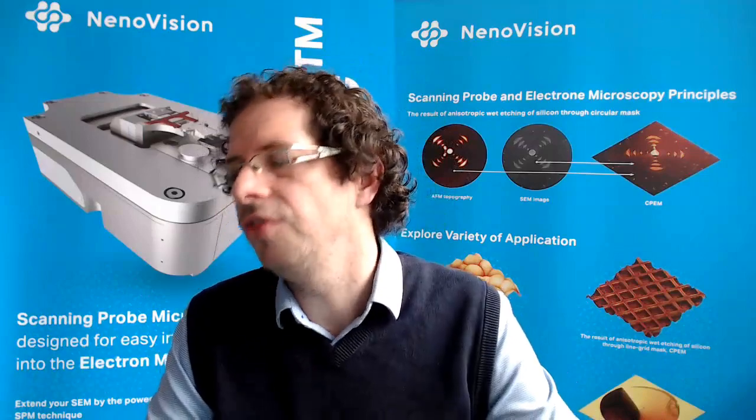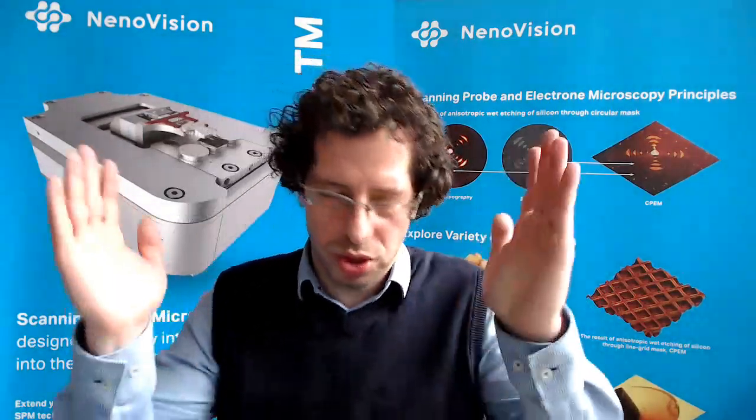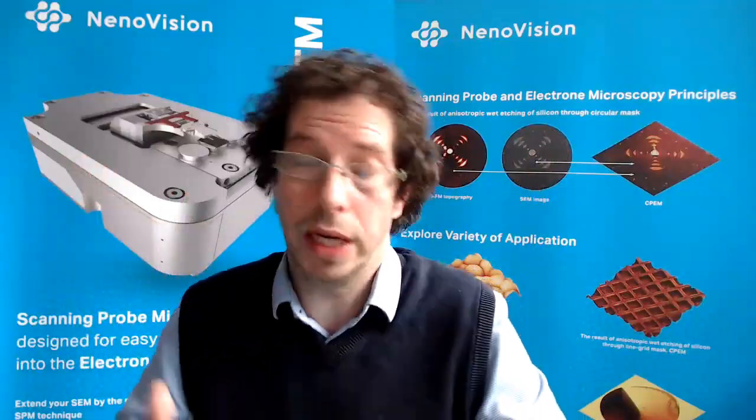Usually the diameter is about 10, 15 nanometers, and these are commercially available. If you really want something extraordinary, you can use a FIB to make it even sharper, or we can do it for you. Then I think we reach about 6 nanometers in radius.